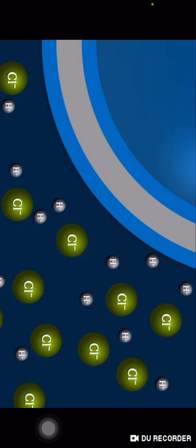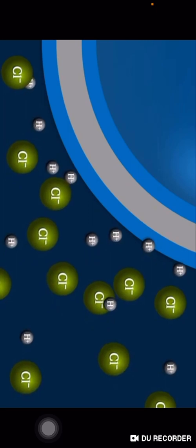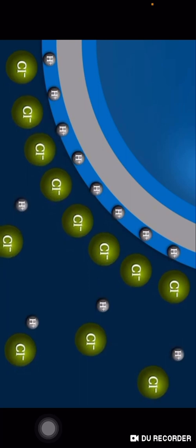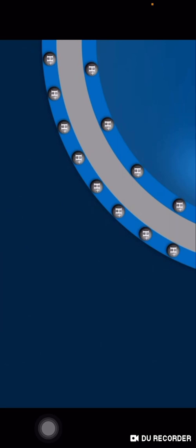Diluted hydrochloric acid, for example, contains large negatively charged chloride ions and small positively charged hydrogen ions. When the pH sensor is immersed into this acid, hydrogen ions are able to penetrate the boundary area of the glass membrane, the so-called gel layer. The large chloride ions remain in the solution. The result is charge separation. The same process occurs on the inside of the sensor with the neutral solution buffered at pH 7, that is, a constant concentration of hydrogen ions.